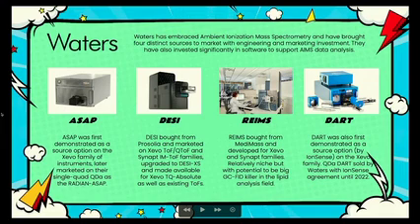You've got that molecular weight specificity that can really start to tell you if you've got a problem with a sample very, very quickly. Very, very cheap in terms of an instrument, and the single quad QDA is a very, very robust instrument, tends to stay quite clean, doesn't have too much of an issue with the instrument having to be stripped apart and cleaned from source to detector. So it's a nice starting point.